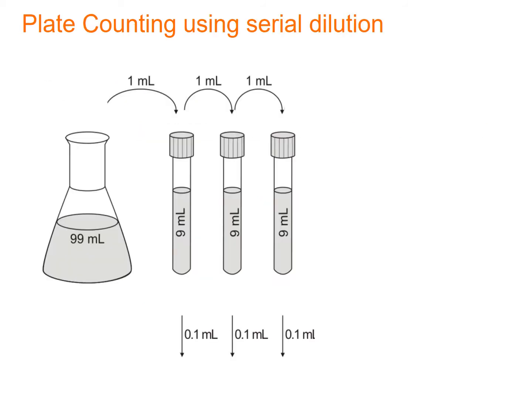So now let's say that I start with a water sample, and the water sample looks crystal clear. I can't see any bacteria, so I know that there's less than 1 times 10 to the 6th. Let's just cut that concentration in half so that we have a very high density of bacteria that would certainly be considered unsafe by the EPA. That's also far too many to be able to count. If I was to put 1 milliliter of this onto a petri dish, I would end up with a lawn of too many bacterial colonies all growing together.